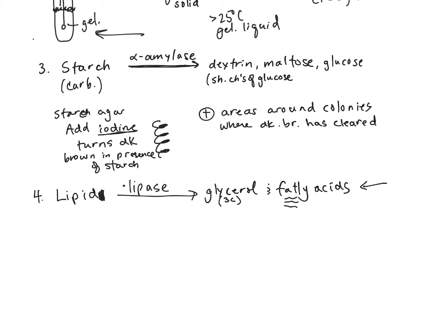Okay, our media here is the one that's not intuitive. It's called spirit blue agar. And it's the one that, if you look at it really closely, it is blue, but it has all these little fat droplets in it. So if you hold it up to the light, you really can't even see through that. So again, your book says to inoculate it in a straight line like this. Either you can inoculate that way or just stick with the 4 quadrants.